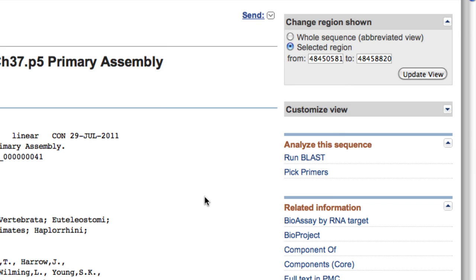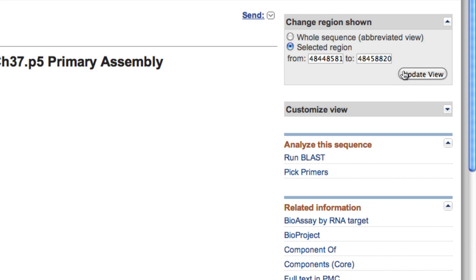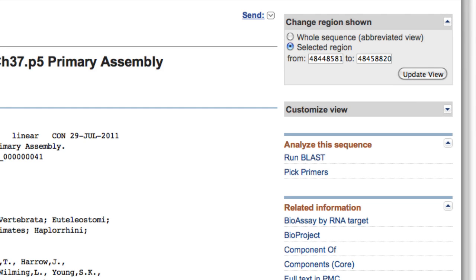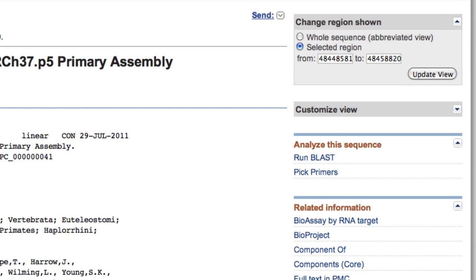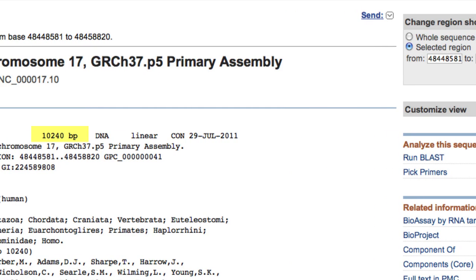If you want to include, say, 2 kilobases of upstream sequence, decrease the from coordinate by 2,000. Click Update View, then download as before. Note how the number of base pairs increases by 2,000.